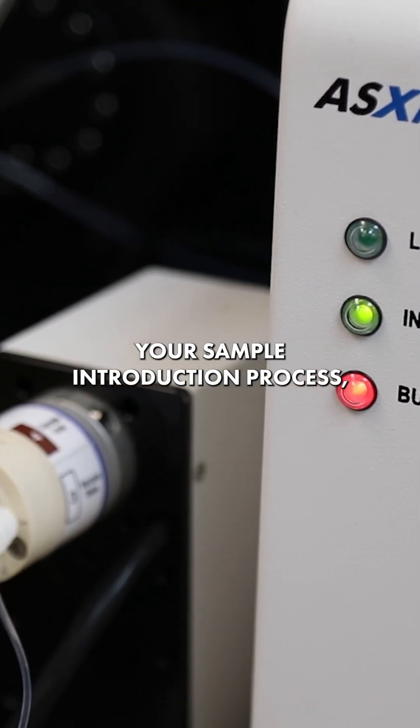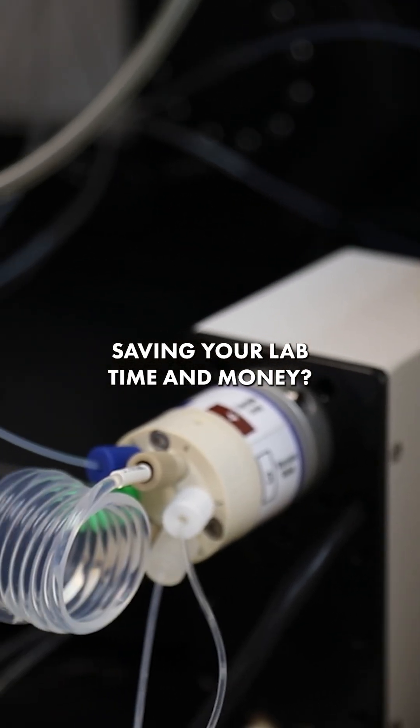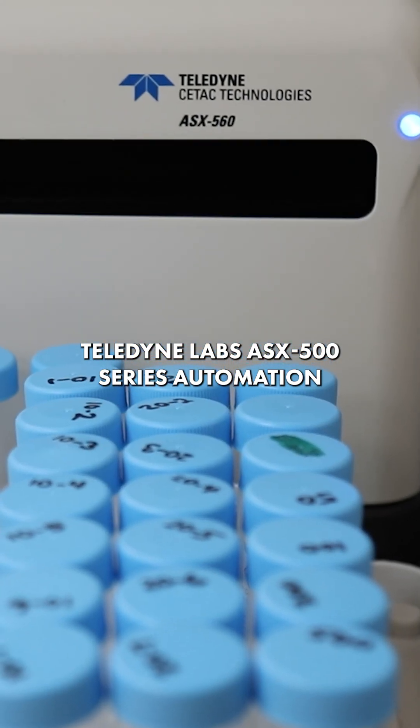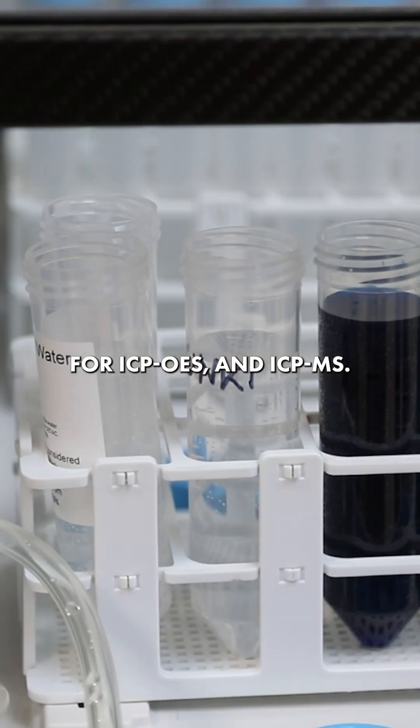Want to accelerate your sample introduction process, saving your lab time and money? The AS Express Plus supports Teledyne Labs' ASX 500 series automation for ICP-OES and ICP-MS.